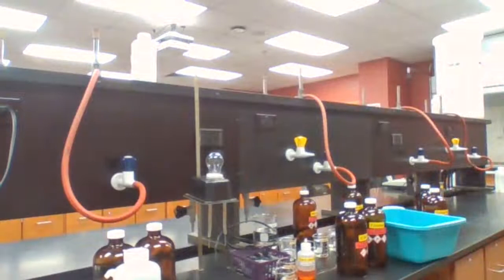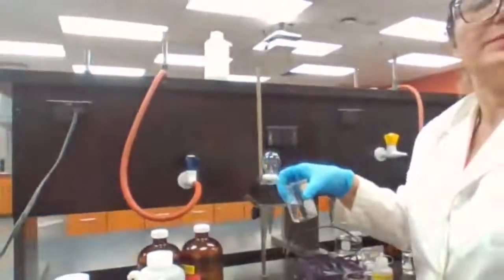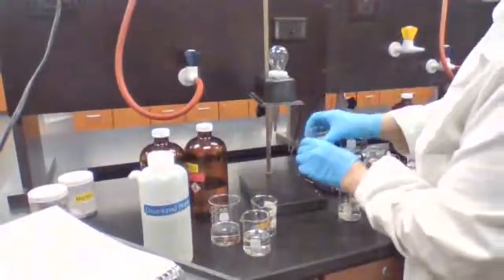So let me find the aqueous ammonia. Okay, one more time, just to make sure that you have everything in one place.